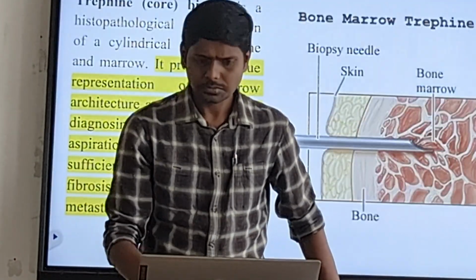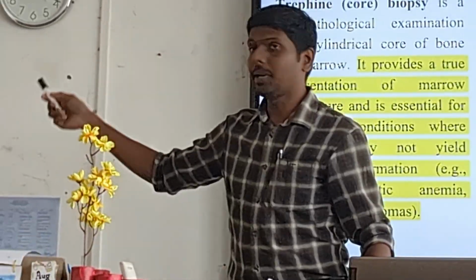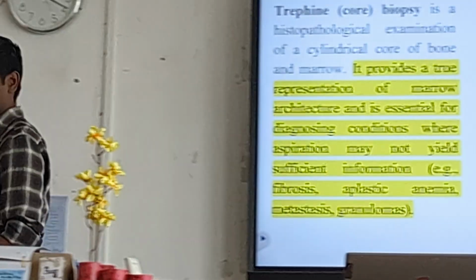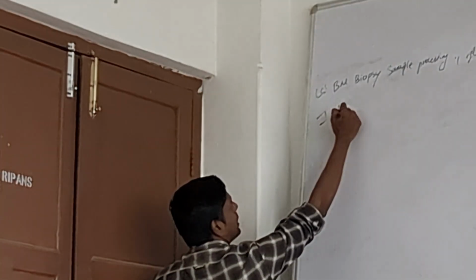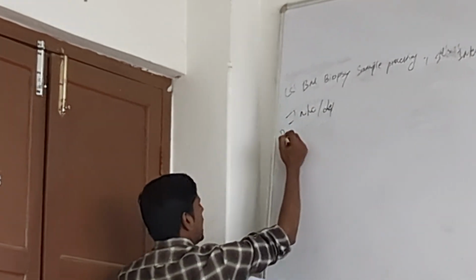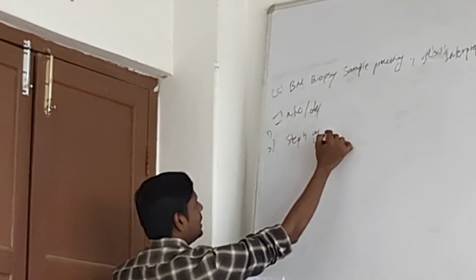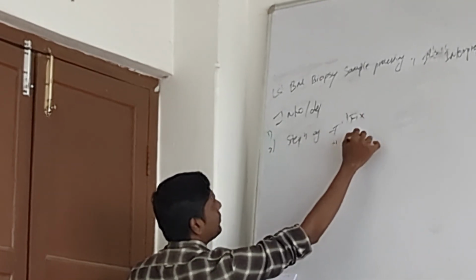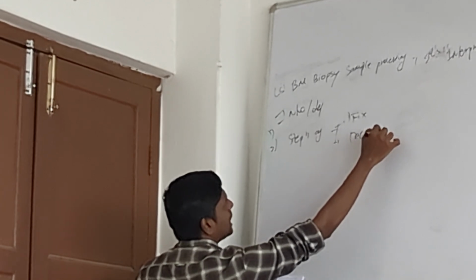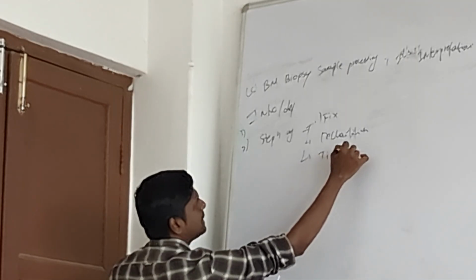Very good. By the way, I need to write the breakdown of the lecture, right? A quick breakdown of what I will focus on. In today's lecture, we will discuss its introduction or definition, and I will focus on the steps of processing, which include 1 fixation and 2 decalcification. Then I will focus on 3 tissue processing.